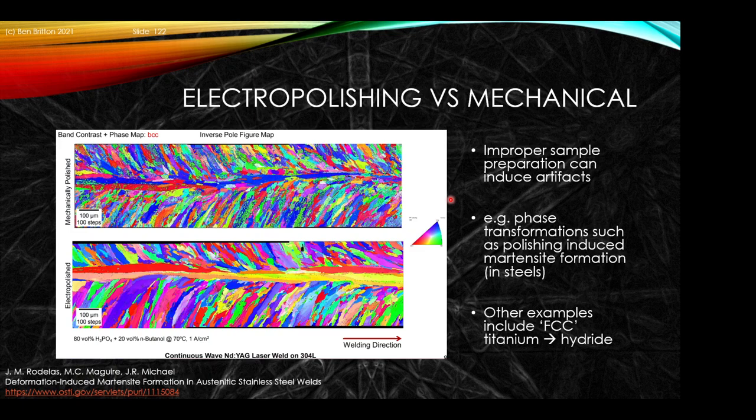Just one example: if you do the polishing badly, you can get evidence of the polishing process and not of the microstructure. This is a beautiful example from a weld in 304 stainless. There is a transformation that can happen during polishing that gives rise to fragmentation of the grain structure. If you remove that surface polishing damage with an electro-polish — using a chemical attack with applied voltage — you can get a much better representation of the microstructure present in your material.